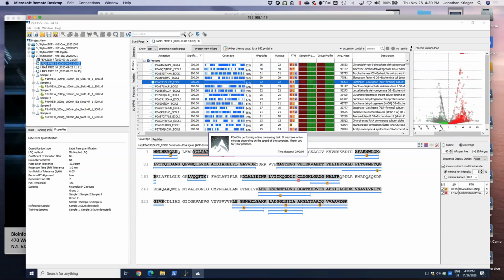I apologize again. So what happened here with that data set that I just showed is essentially the library wasn't configured. So it wasn't run on this computer that I'm on, and I didn't direct the software to where the library was. And so with DIA data, if you're transferring data, you need to make sure that the library is imported in the software, and that the same library that was used to search the data is available for the software to reference.